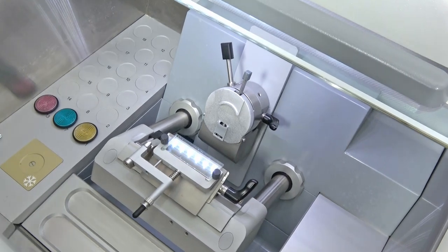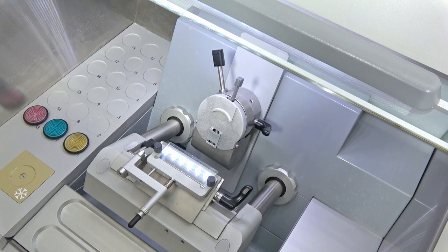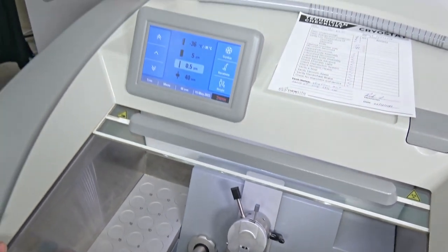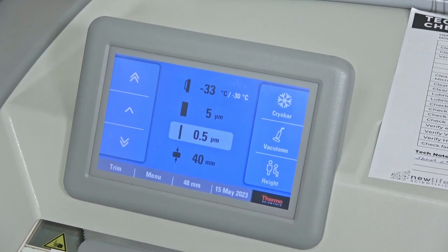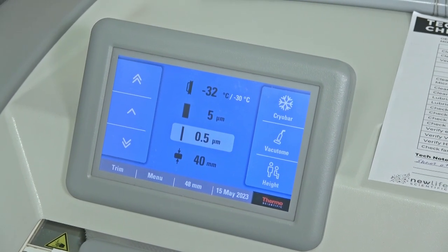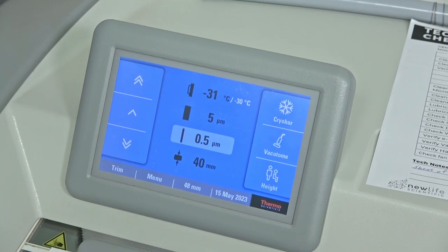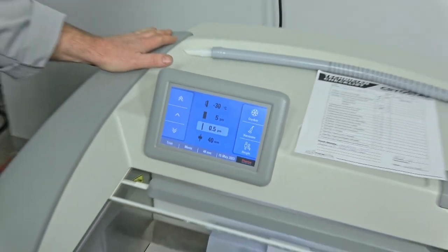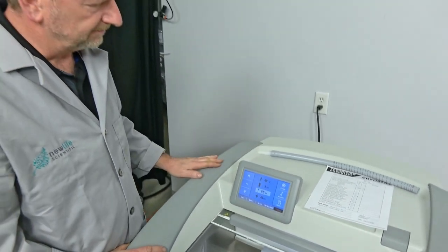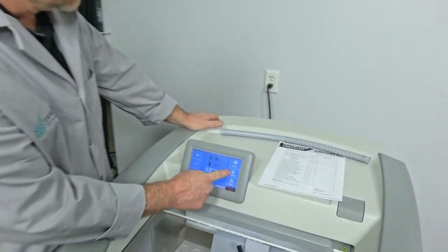We're going to see that Peltier kick in and the temperature drop quickly. I actually did replace a couple of the Peltiers — I put a brand new one in. It's sitting right behind this plate, so we've got top performance on that. You can see it's already coming up to negative 30 very fast, and it just hits that spot and holds it there. That's one of the really nice things, especially if you're doing some soft tissues like liver or brain.